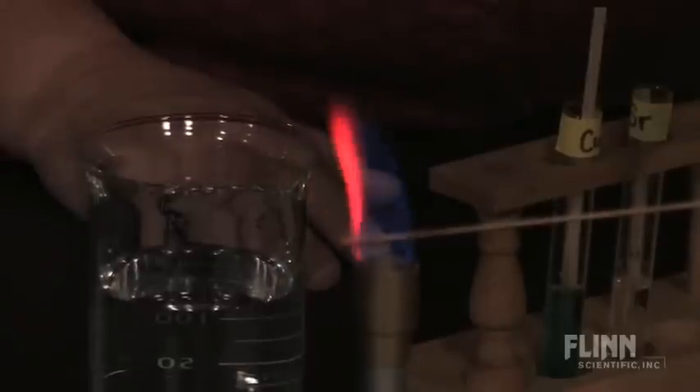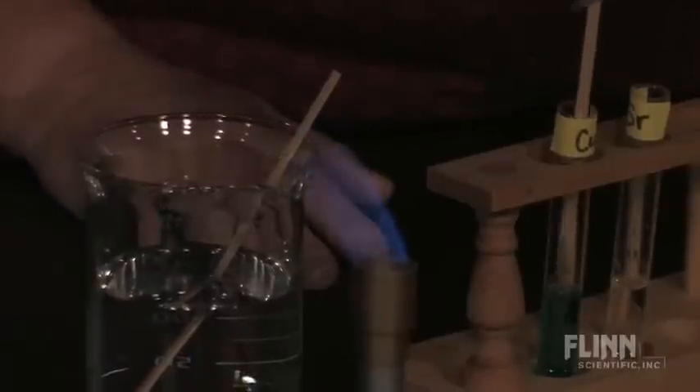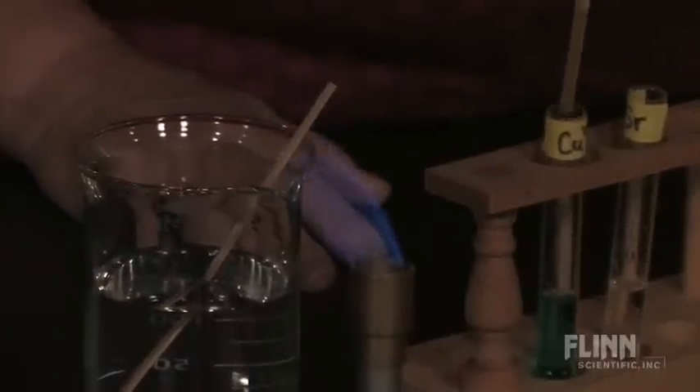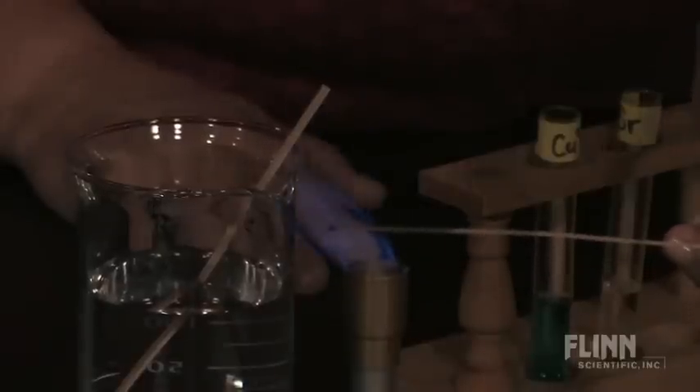Observe the characteristic color of strontium. Repeat the procedure with all of your metal salt solutions. And here we have copper.